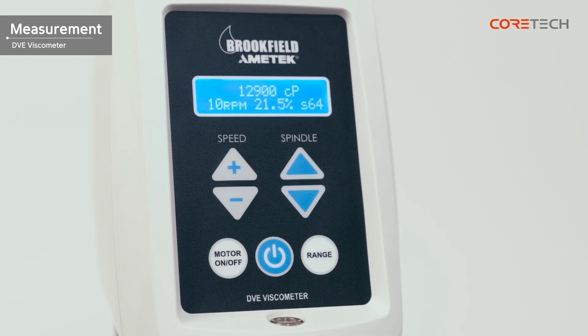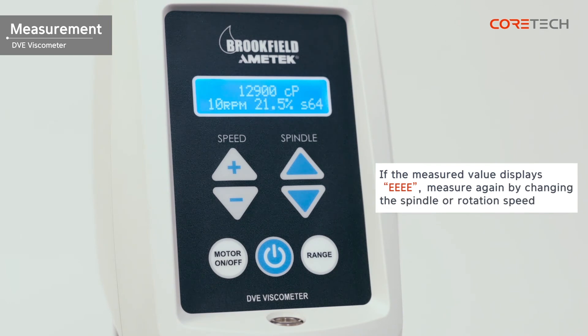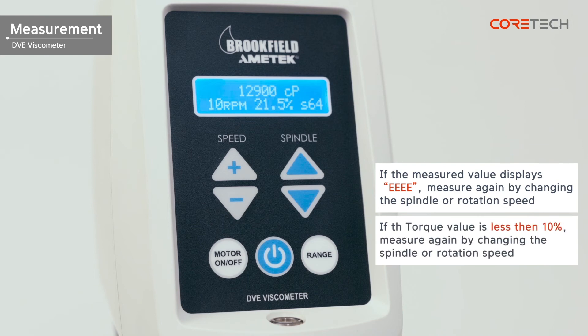If the measurement is not displayed and 'EEE' is shown, it is a sign that the value has gone beyond the measurement range. In this instance, first measure by changing the RPM, and secondly measure again by replacing it with a different spindle. If the torque value is less than 10% when the measured value is stabilized, measure again by changing the spindle or rotational speed.